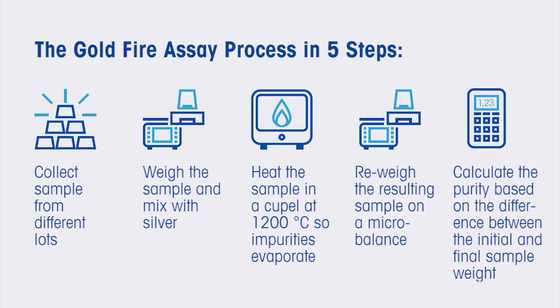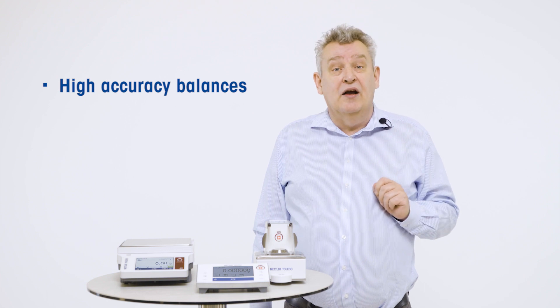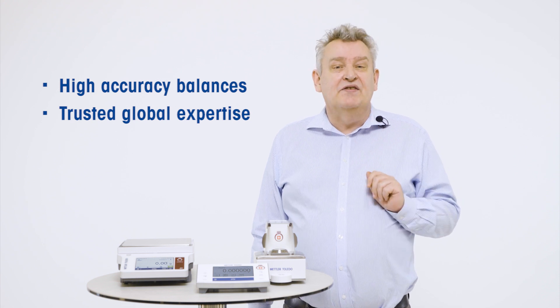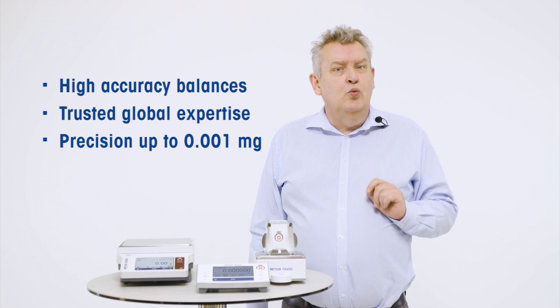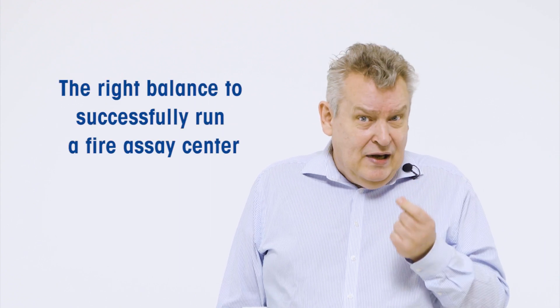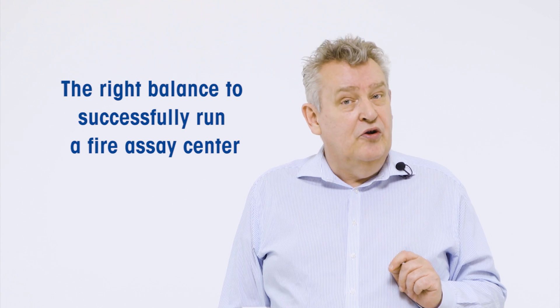As a Mettler Toledo customer, you will enjoy the most accurate and state-of-the-art balances on the market. Trusted for gold fire assay applications worldwide, our balances with precision up to six decimals to the gram provide you with the highest performance and the peace of mind you need to run a successful fire assay centre. Only with such accuracy can you get the results you need for gold purity testing.